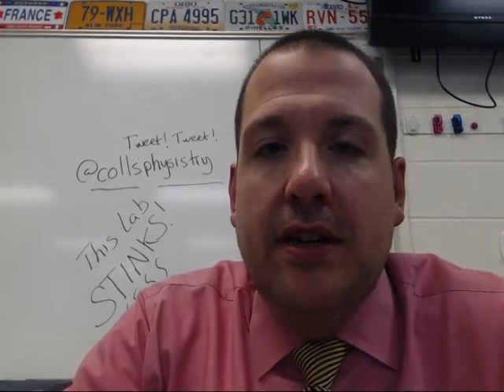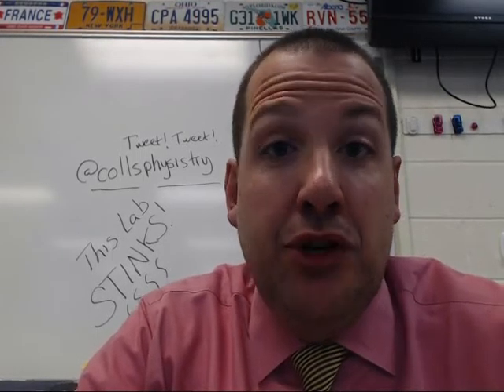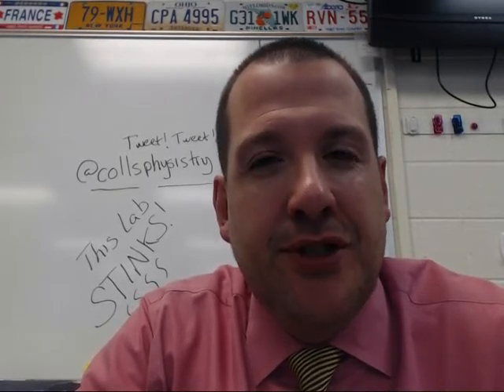Hey everybody, I wanted to take a little bit of time and give you a little bit of a pre-lab for the rotten egg lab, lab 2, that you're going to be doing. So this lab is really exploring mixtures and compounds.